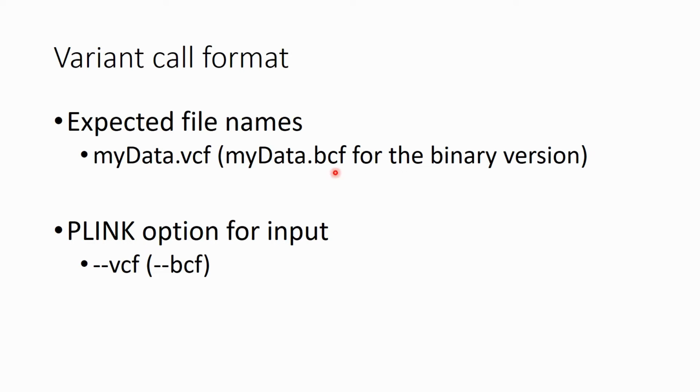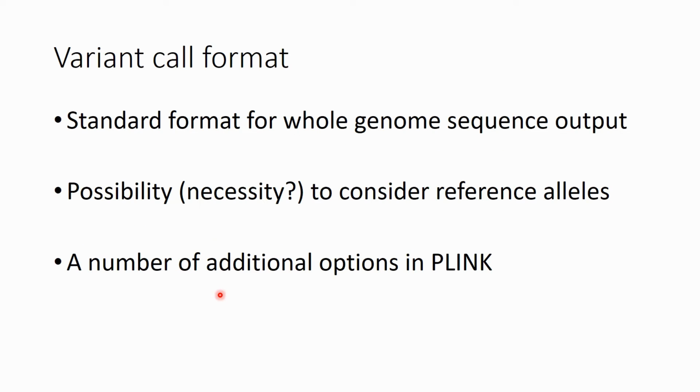Also, there is an option for BCF files, which are the binary versions of VCF files, so these could also be loaded. If you want to do so, you should use the --vcf or --bcf option. As I mentioned, the VCF files are the standard output files from whole genome sequence analysis, and therefore you might come across them quite often.